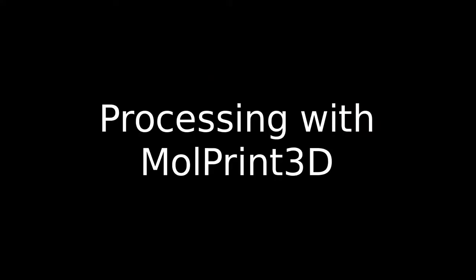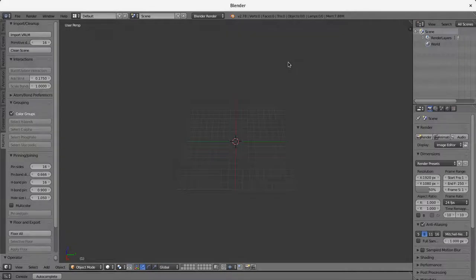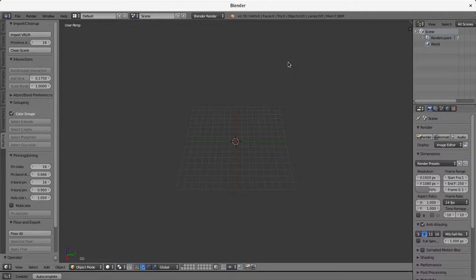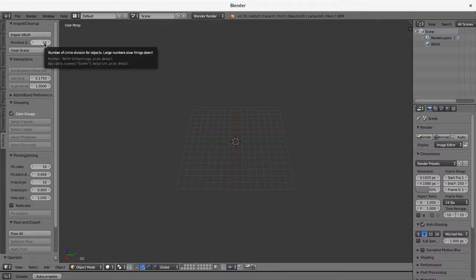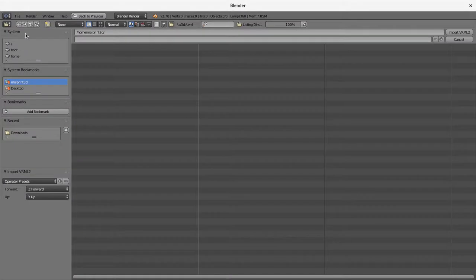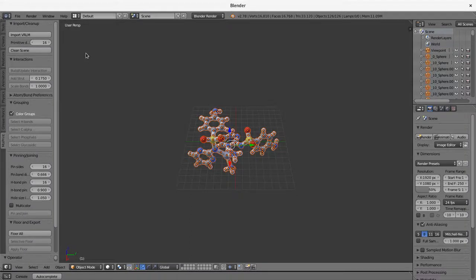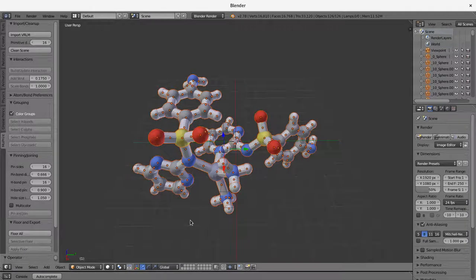And this has now been saved into our VRLM file. And we'll open this up with molprint3d. To open with molprint3d, we use the import VRLM button. And we're going to use just the standard 16 side primitives for this. This defaults to our download directory. And now we've imported this file.